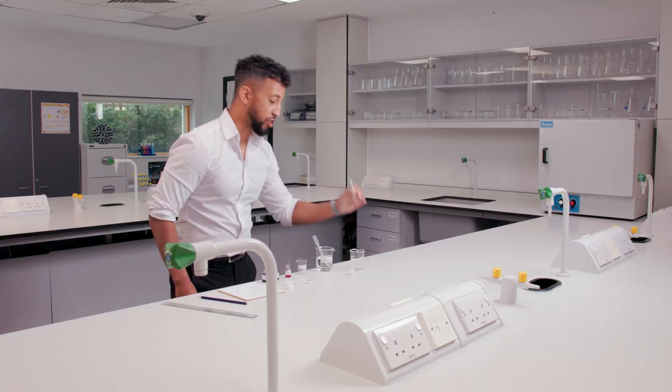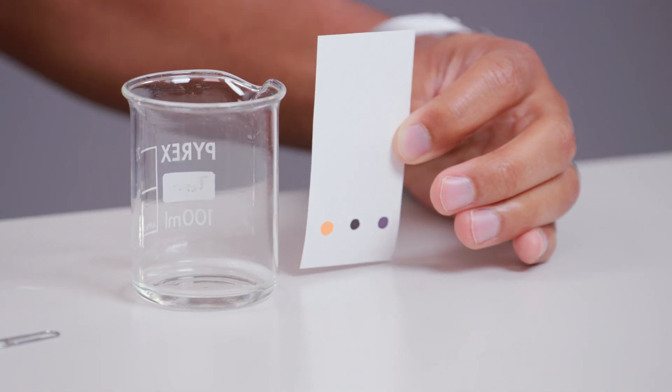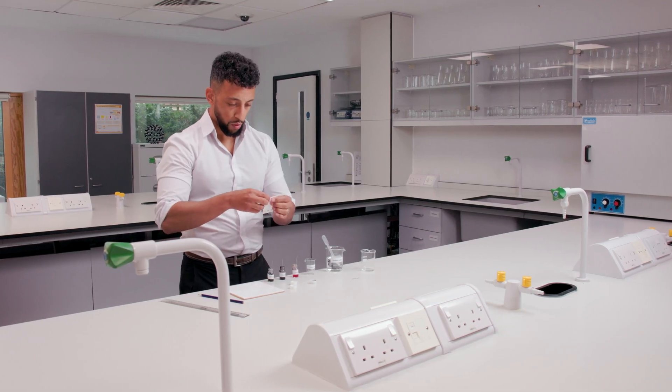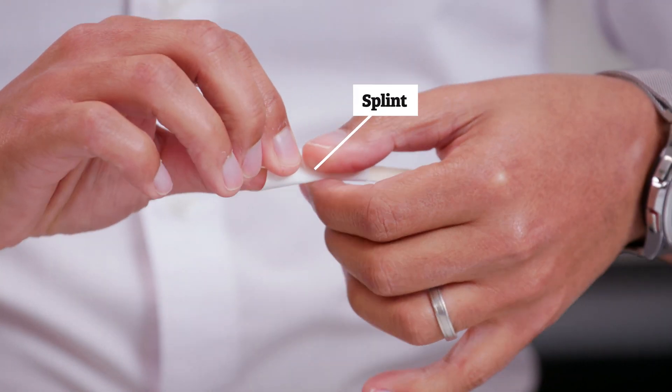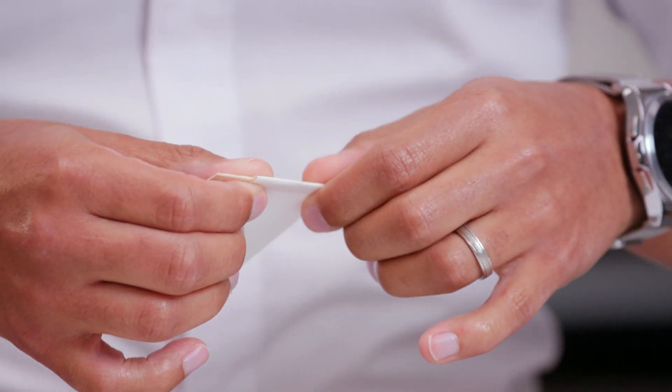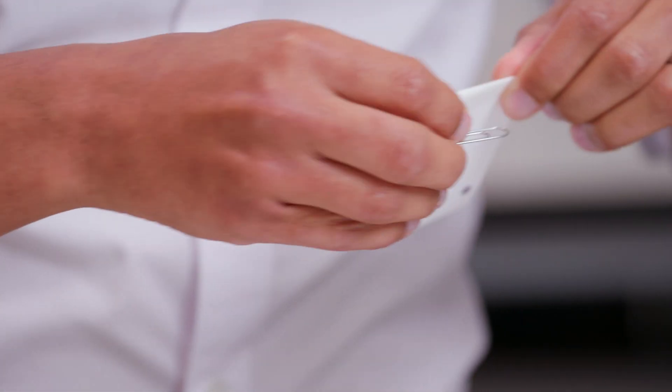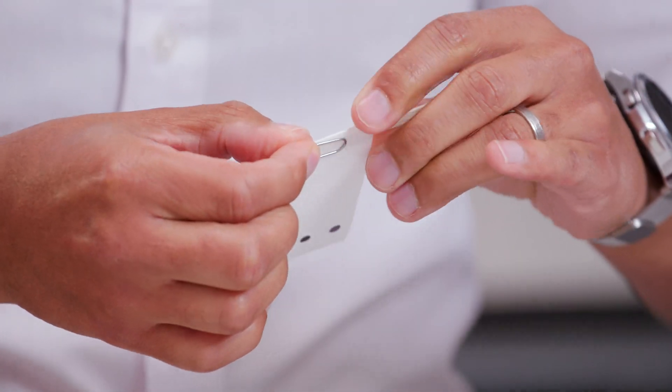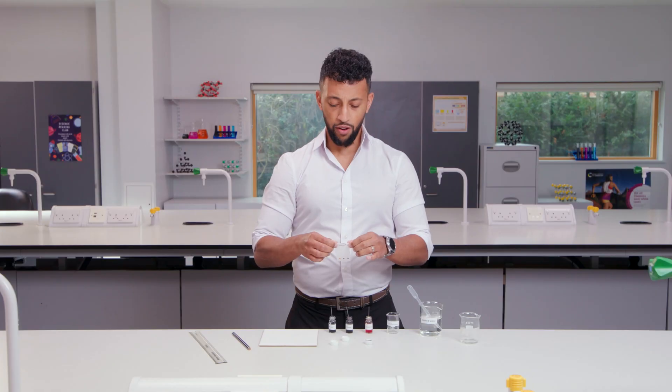I'm going to line up the paper outside the beaker so I can measure how long it needs to be. Keep the paper in place by wrapping it around a splint and securing it with a paper clip. Like this.